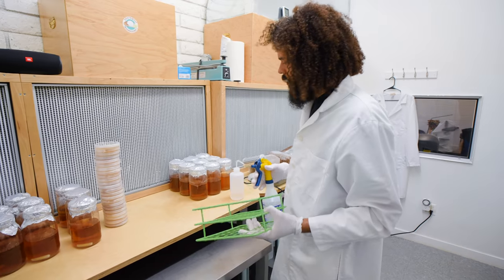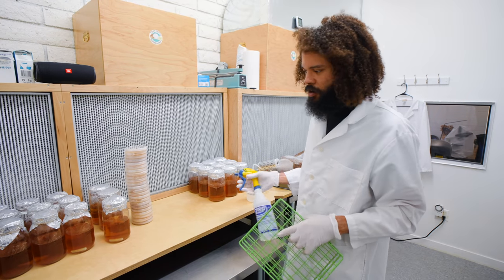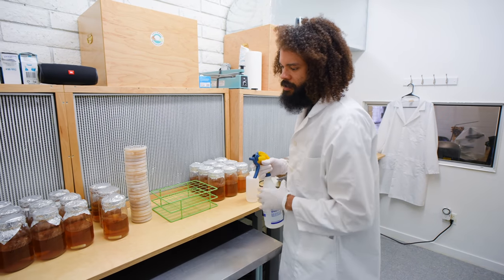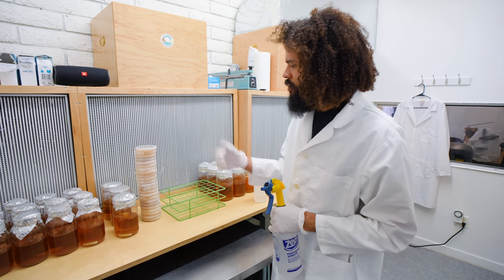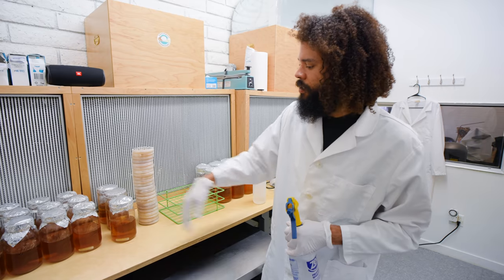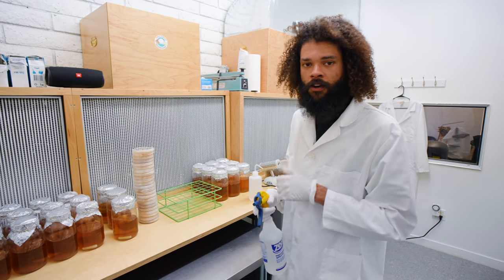Today I'm going to be doing some inoculations with liquid cultures. This is a liquid culture I prepared yesterday consisting of light malt dextrose and 500 milliliters of water. We're going to take simple tissue transfers and place them into these jars to grow out and use for spawn production here at our farm.